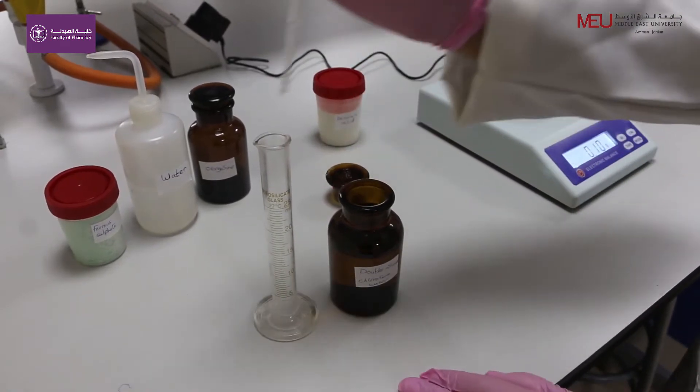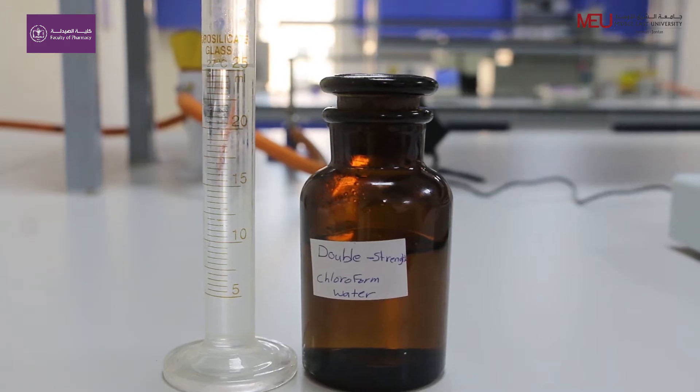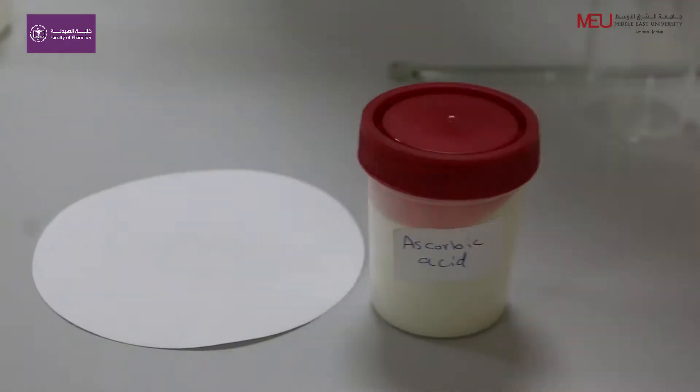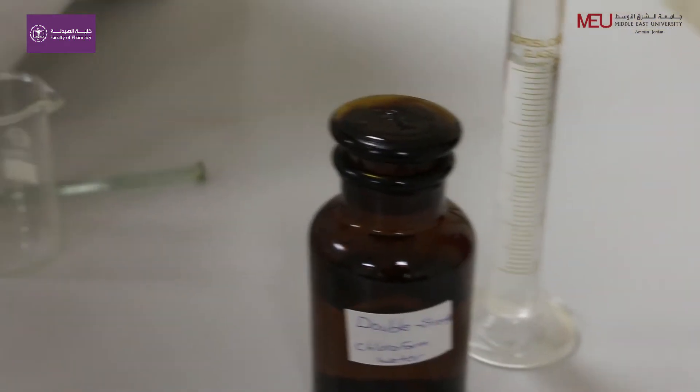Measure 25 ml of double strength chloroform water, which is used as preservative, flavoring agent, and as vehicle. Dissolve the ascorbic acid in the chloroform water.